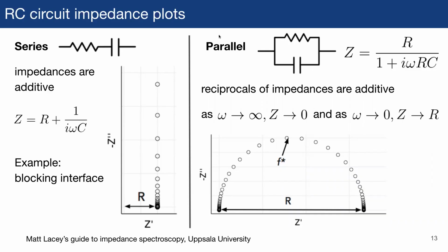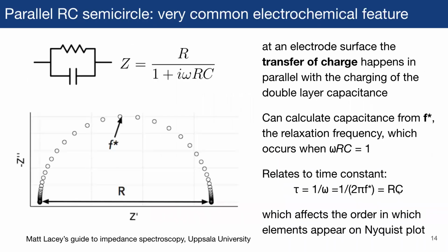So this type of circuit is quite important for equivalent circuit modeling. So basically when we consider charge transfer, we need to have this resistor representing the charge transfer, but also we can have a sort of double layer capacitance happening at that interface that ultimately is modeled by this capacitor that we have as well.